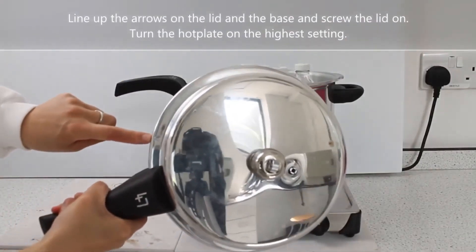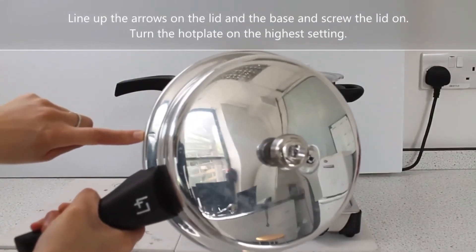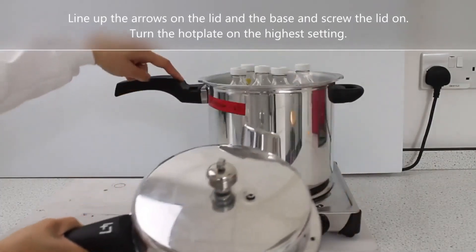Line up the arrows on the lid and the base and screw the lid on. Turn the hot plate on the highest setting.